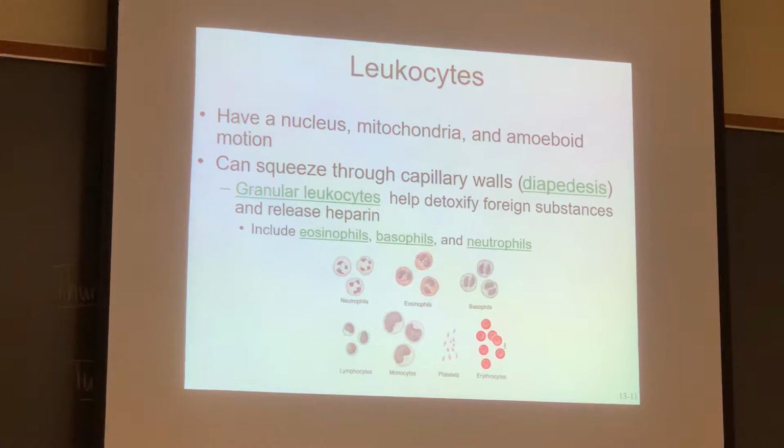For this, you probably want to use the poster, because it's higher magnification than what we can do with the light microscope, but you can use your oil immersion lens, and that will give you greater detail when you're trying to identify them.